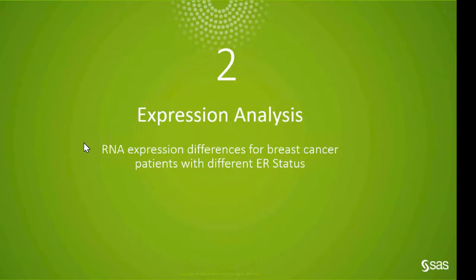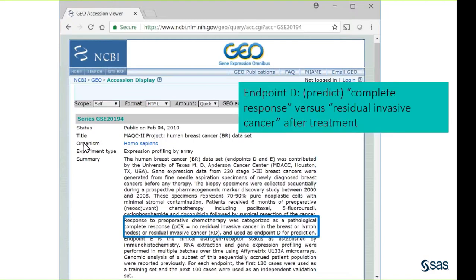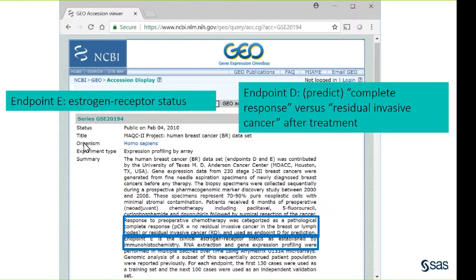Our second example is expression analysis. Instead of genetic data with SNPs, we have genes or probe sets where we're looking at RNA expression. Here we're looking at differences for breast cancer patients - everyone in the dataset has breast cancer, so we're not looking at cancer versus non-cancer but other endpoints. These data were published in 2010, pulled from GEO, and one endpoint is predicting complete response versus residual invasive cancer after treatment. Another endpoint is estrogen receptor status.